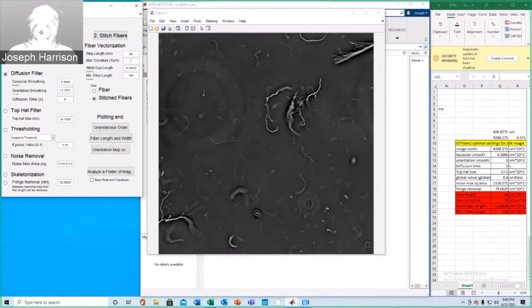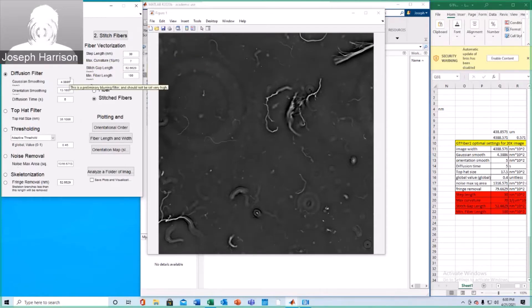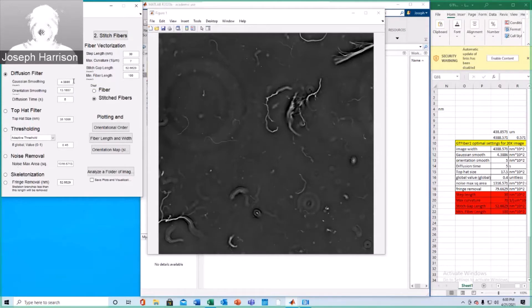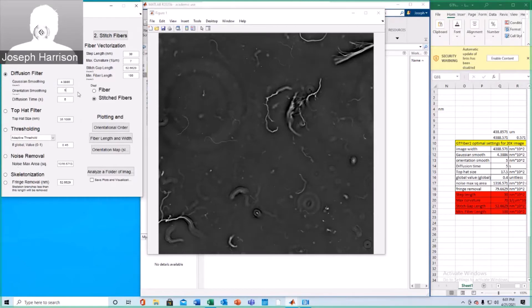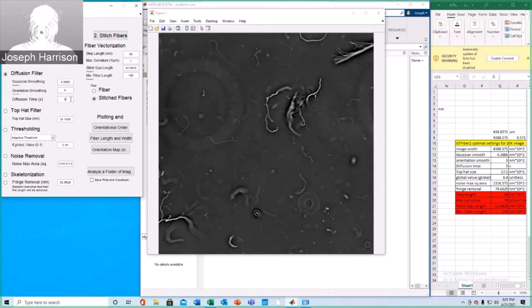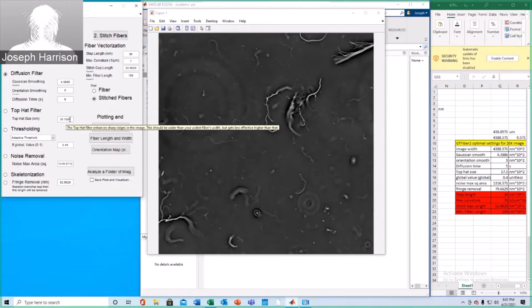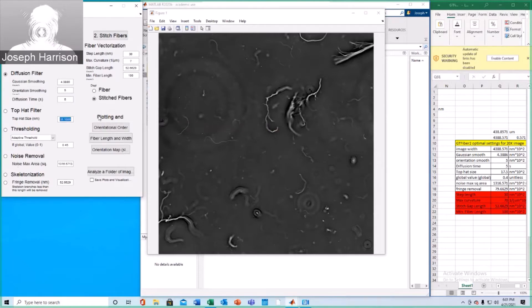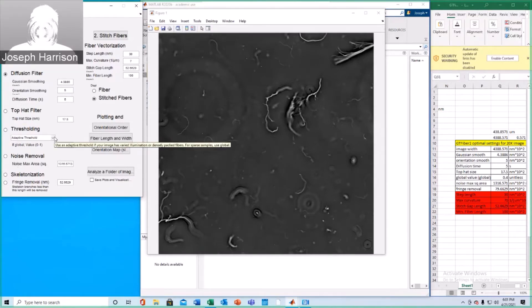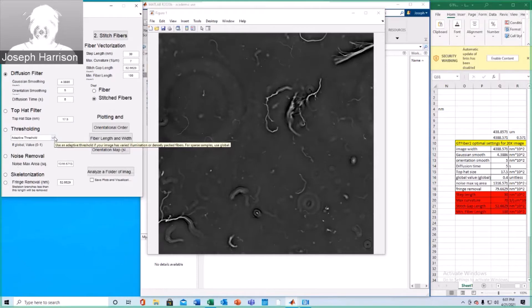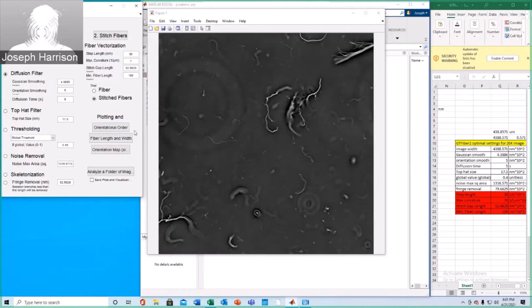Okay, so we have selected invert color. Now we need to input the correct parameters. Gaussian smoothing auto-updates to about 4.38. That's fine according to a bunch of tests that we've run. Gaussian smoothing typically works best at a value of 5 for images of this width. Leave diffusion time as is. Top hat size is essentially halved to 17.5. You're not going to want to use adaptive threshold for a lot of these images, at least with the ones we've found on our microscope. We find that global threshold is much more appropriate and a global value of 0.4 typically works best.